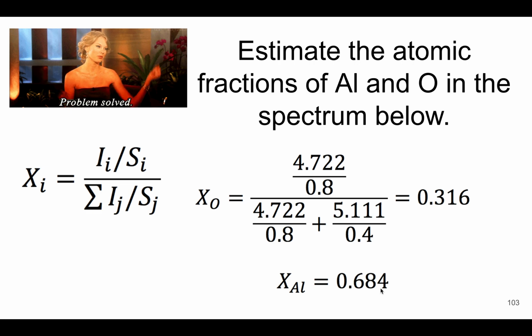Right? So that's how we can use this. If it was XPS, similar procedure, but we're going to get the peak area. So that's a little harder to do while you're looking at a slide here. So we went with AES. So that's how we're going to calculate these things. So obviously, if I give you a homework problem or something like that, then maybe we do XPS where we have to get peak area.